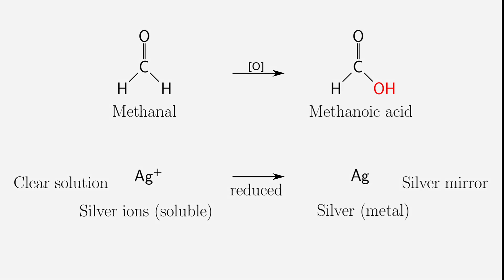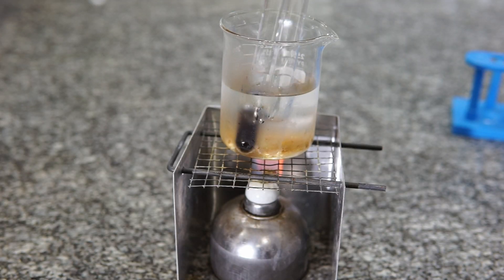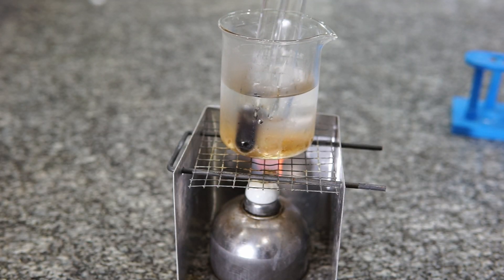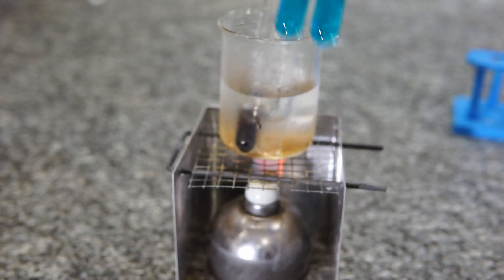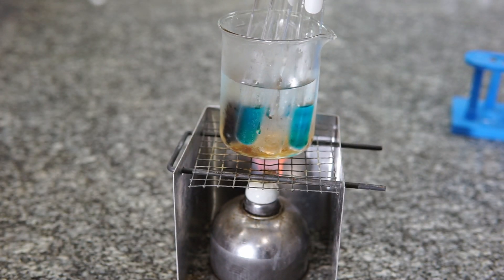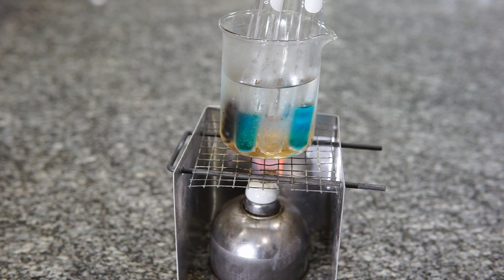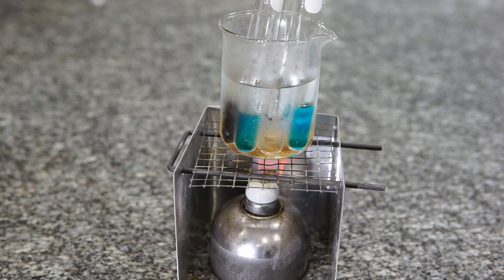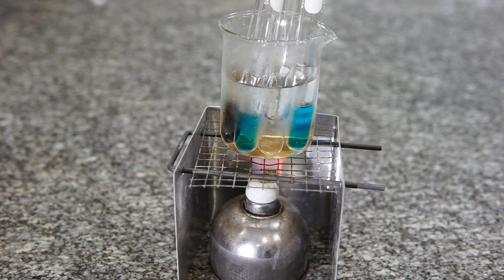Let's go back to the experiment. So we needed to heat up the test tubes. You should see in this footage that the black precipitate we had in the aldehyde and the Tollens reagent is changing gradually and getting more and more reflective.